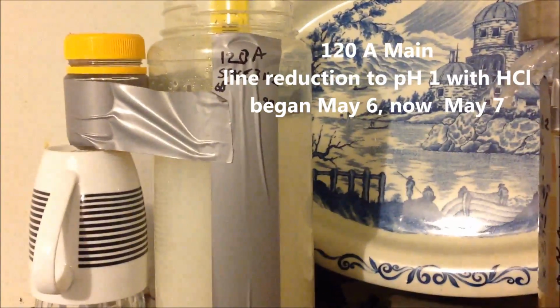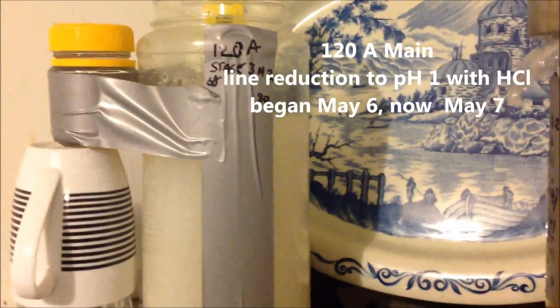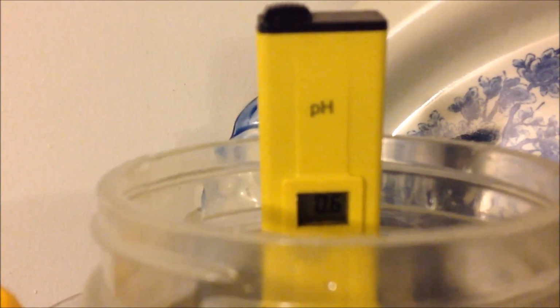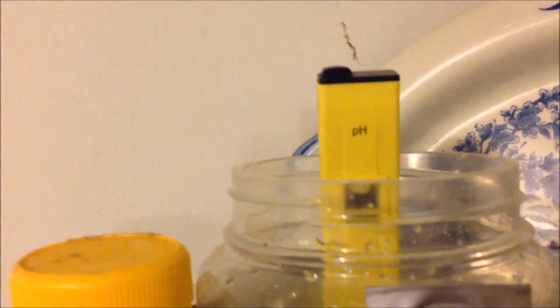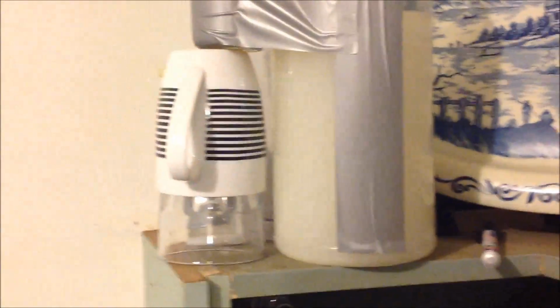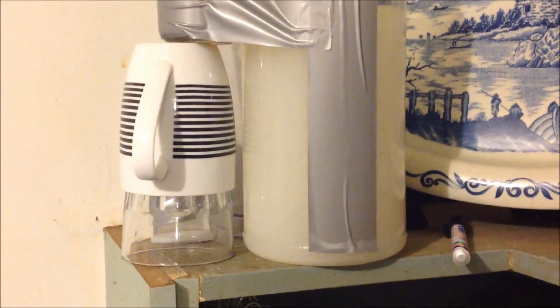Getting towards 24 hours on this 120A, taking it back down to pH of 1, and you can see that it's not settling at all. It's more like a suspension, and it should be clear. You would usually clear in about a few hours. pH is sitting at 0.6, and last night, about 12 hours ago, it was down as low as 0.4, even though it had been left at about 1, 12 hours before that when I'd left it. So the pH is moving around a bit.